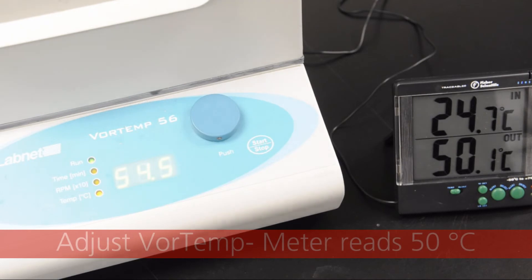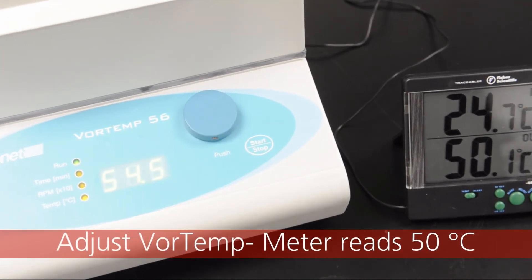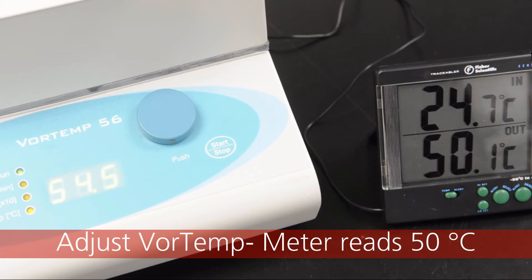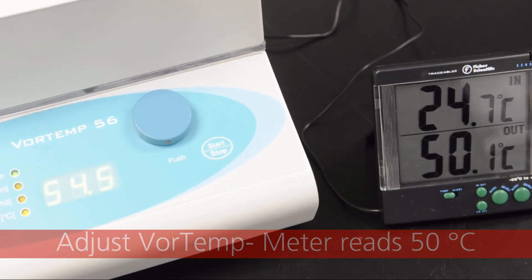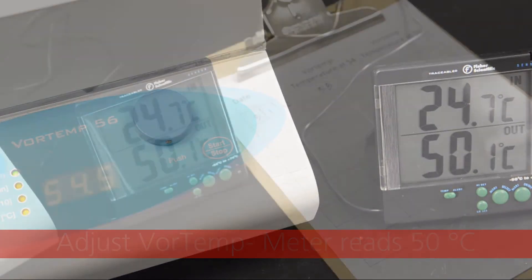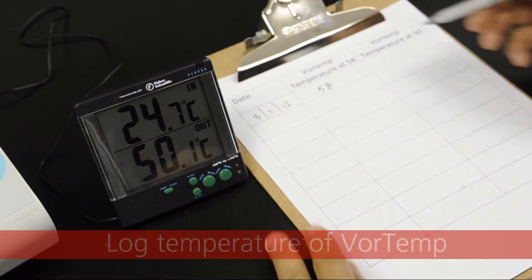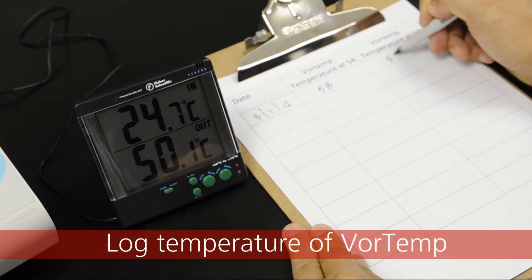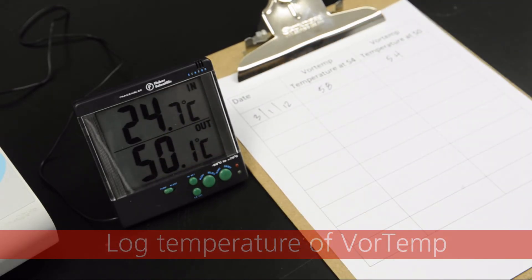Next, adjust the temperature of the Vortemp so that the out display of the digital temperature meter has reached 50 degrees and the reading is stable. Again, log the temperature displayed on the Vortemp and on the digital temperature meter.